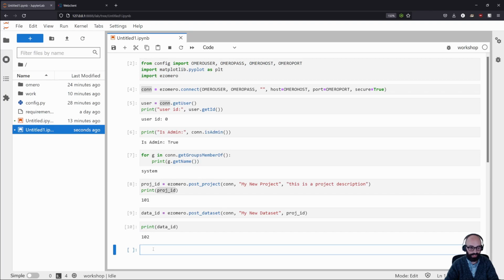And you will see that when we actually do that, there will be a warning saying, hey, maybe don't do this too much. The import process is way more reliable than what we're going to be doing here. It also captures metadata from a specific file format. In this case here, there's going to be essentially no metadata. It's just going to be the pixels stored in disk.